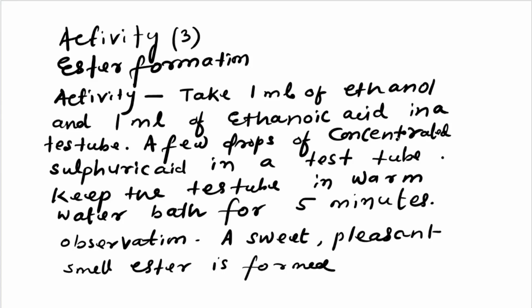This is very, very important. This is for commercial purposes also. Ester formation, and esters are very useful commercially. And what is that activity? Take 1 ml of ethanol and 1 ml of ethanoic acid, the same volume, in a test tube.